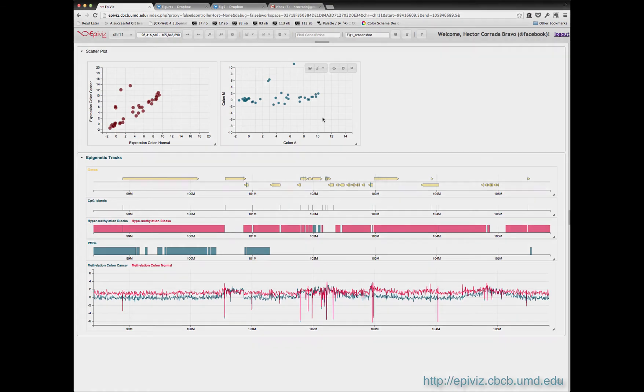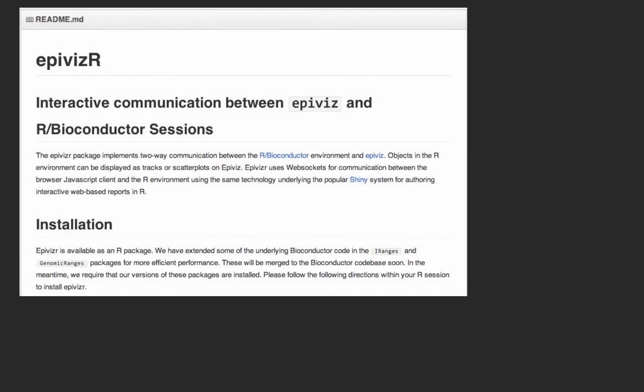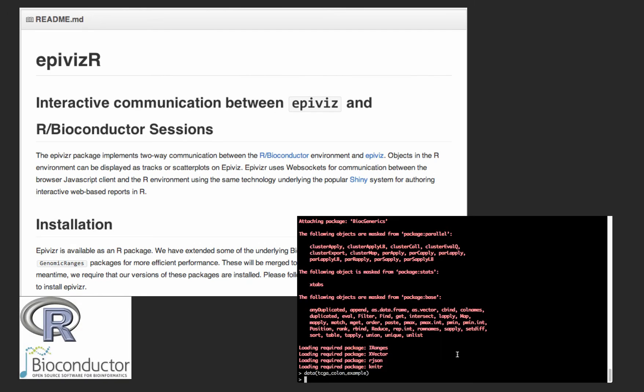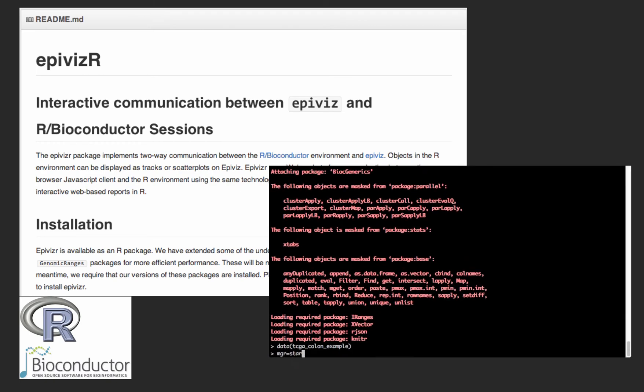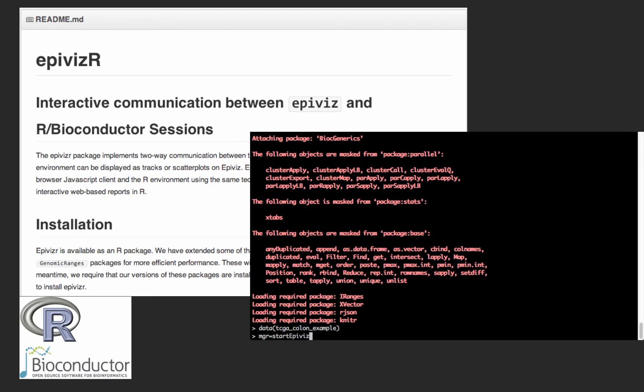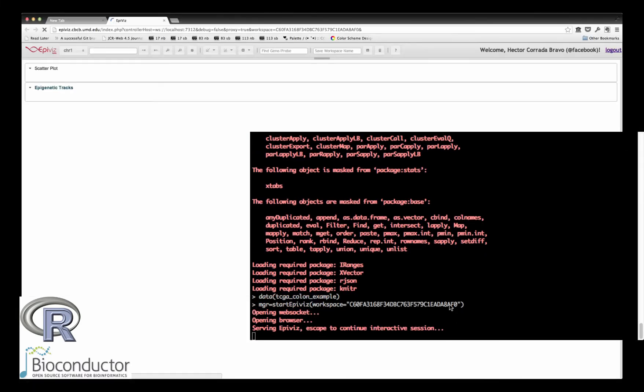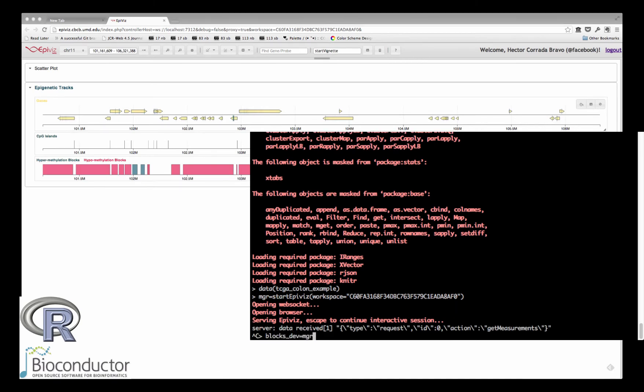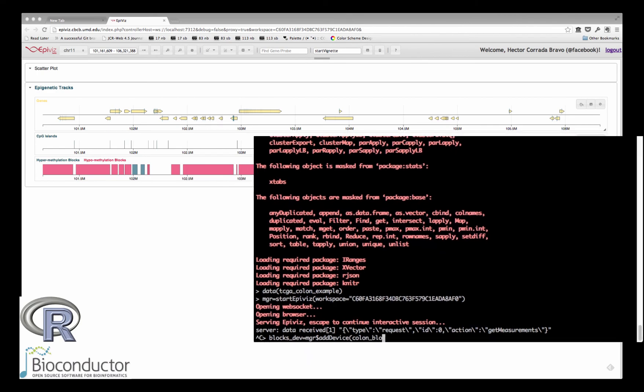Now, the most important feature of EpiViz is its companion R package, EpiVizor. It implements WebSocket connections between EpiViz and interactive R sessions. So we can use EpiViz as an interactive, browsable, searchable display device for functional genomics data and analysis in Bioconductor.